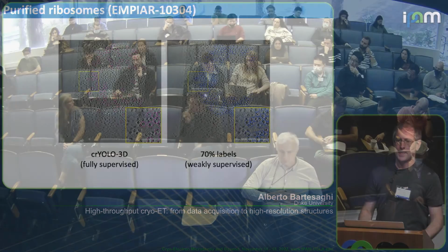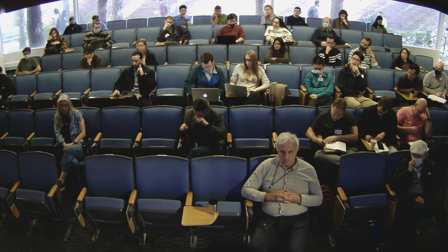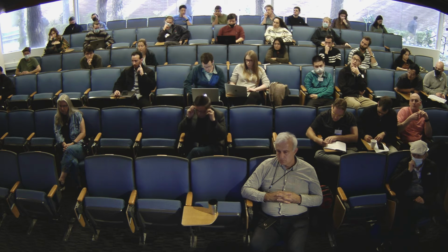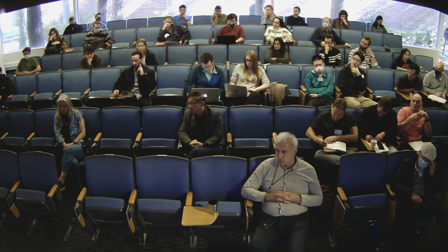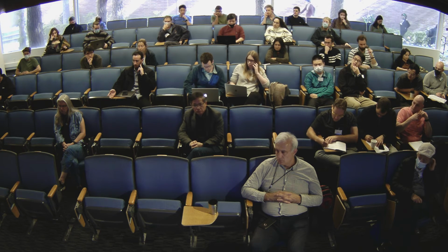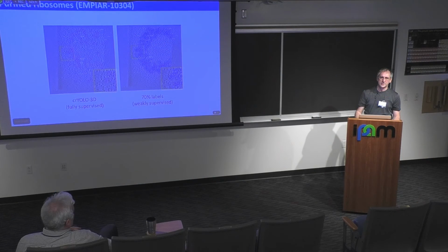Yes. Question, sorry. How can you have a pixel size of 1.3 something, if I recall correctly, with such big pictures, like 5 by 5 holes? That means that we are talking about a square with something like a 10 micron area squared, right? So how can you have such perfect imaging, and then of course are you going to crop and then perform tomogram reconstruction?